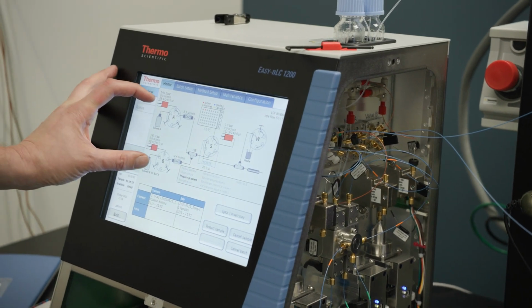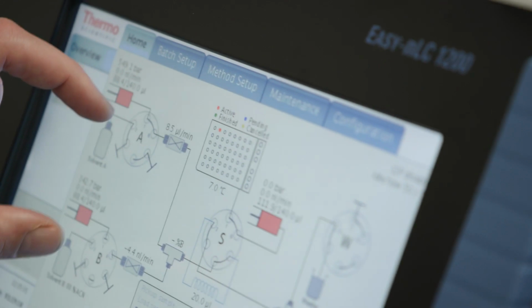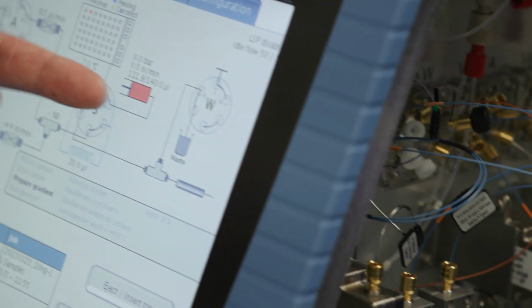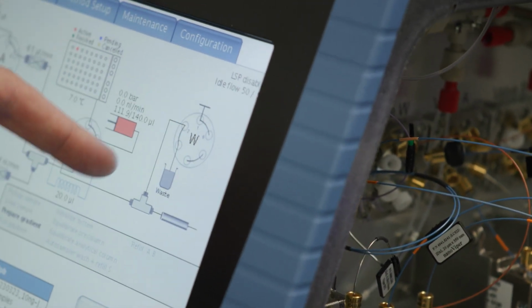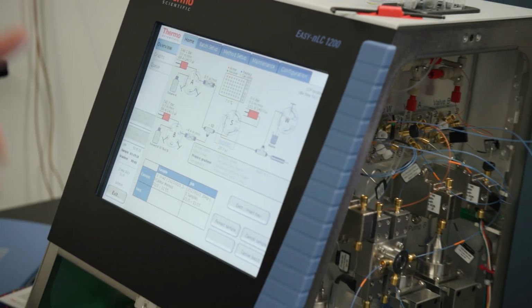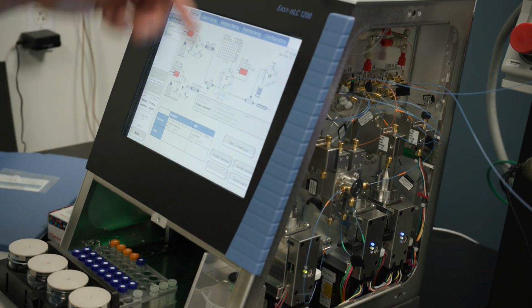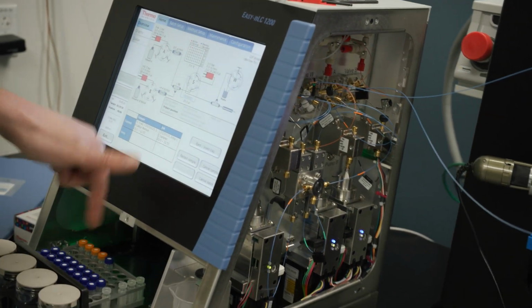And what it is, it's basically just two pumps that are pumping very small amounts of liquid where we can combine them together, inject our sample, and then have them go either to the mass spectrometer, or if we need to wash the sample, we can have it go to the wash waste. And basically what this allows us to do is set up a handful of samples at a time so we don't have to be here for each injection, so that it'll automatically run this sample and then wash the column, and then move over to this sample, run it, and then wash the column, and we can just do that indefinitely.